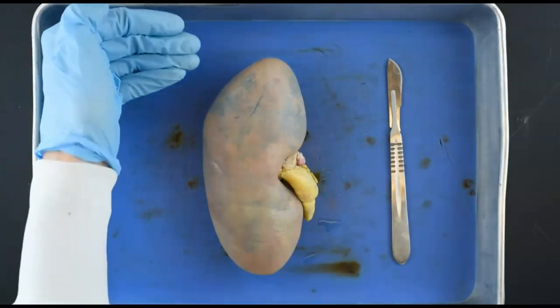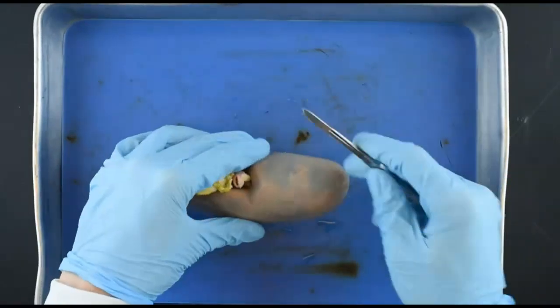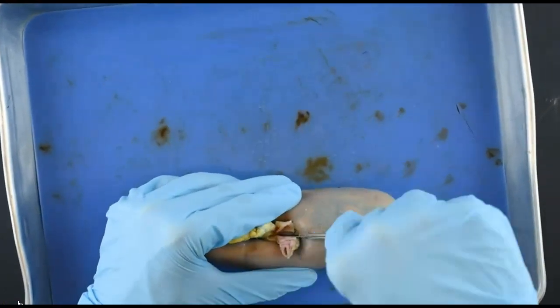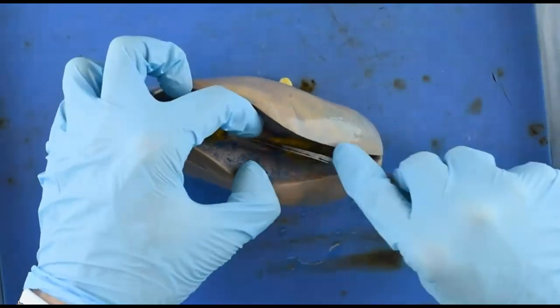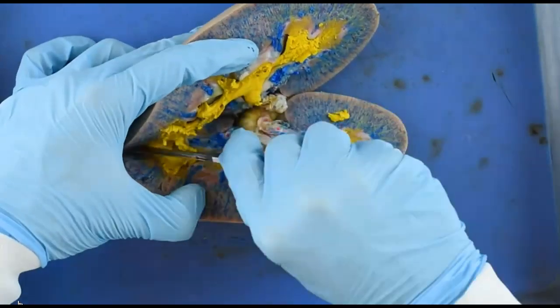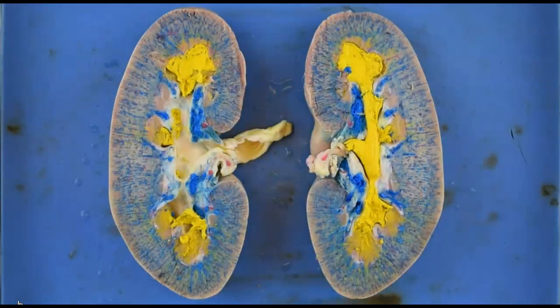Now let's cut the kidney via a frontal or coronal section so we can get a nice mirror image and two nice equal halves so we can see all of the structures and anatomical features. The kidney has a very dense structure, so be careful when cutting, take your time, and don't cut yourself. You should have two halves of the kidney.